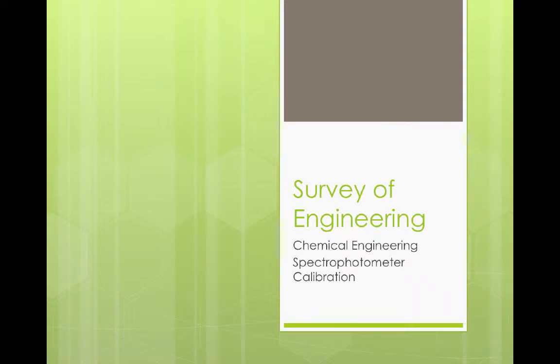Welcome back to Survey of Engineering. In our chemical engineering unit, we are about to go ahead and calibrate our spectrophotometers. So in this video, we're going to talk about how to do that.